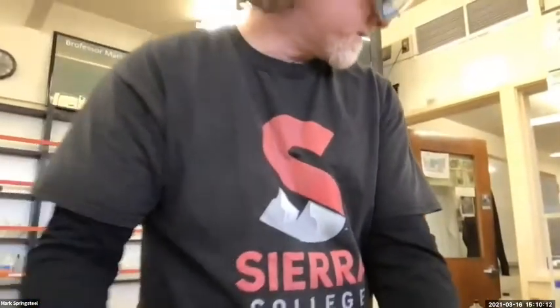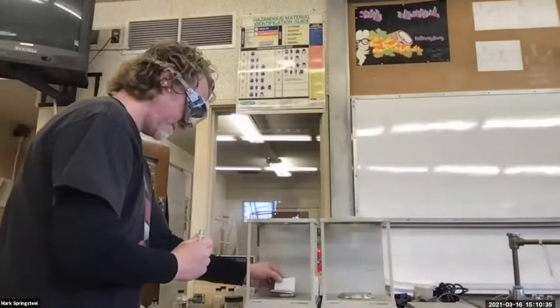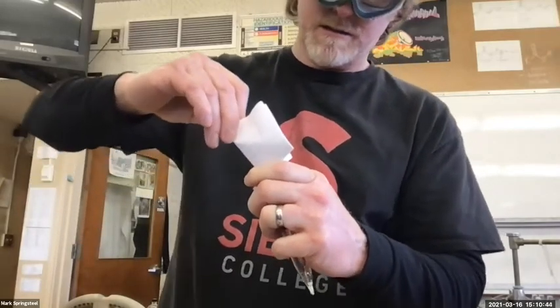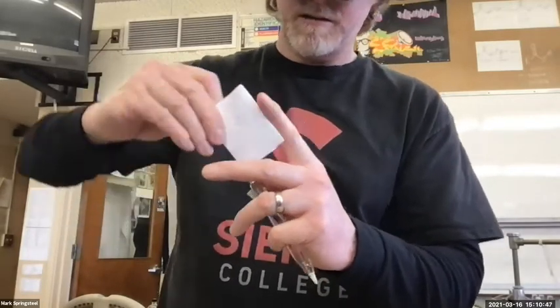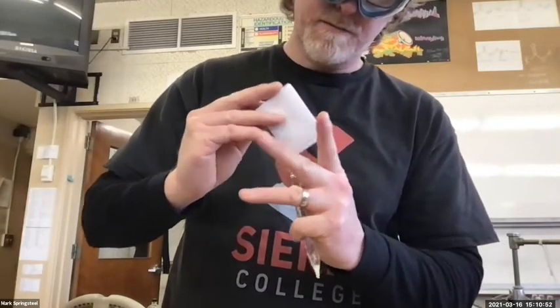That scale's kind of all over the place right now. Not too bad, but close enough. So I'll look back and tell you what it says right now. It says 59.0 milligrams. All right, and then I need to add that to the centrifuge tube. And here's what it looks like. Got it. Oh, yep, got it. There we go.